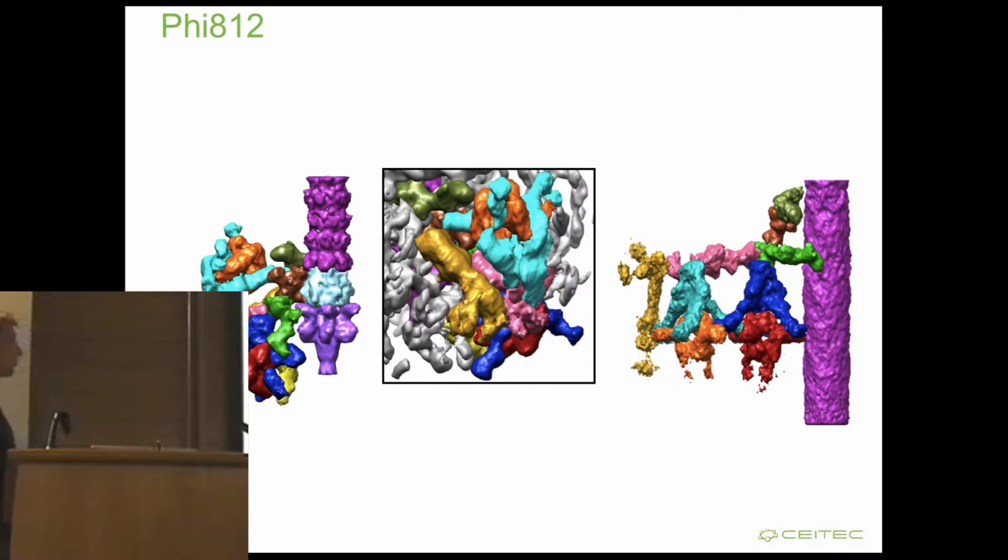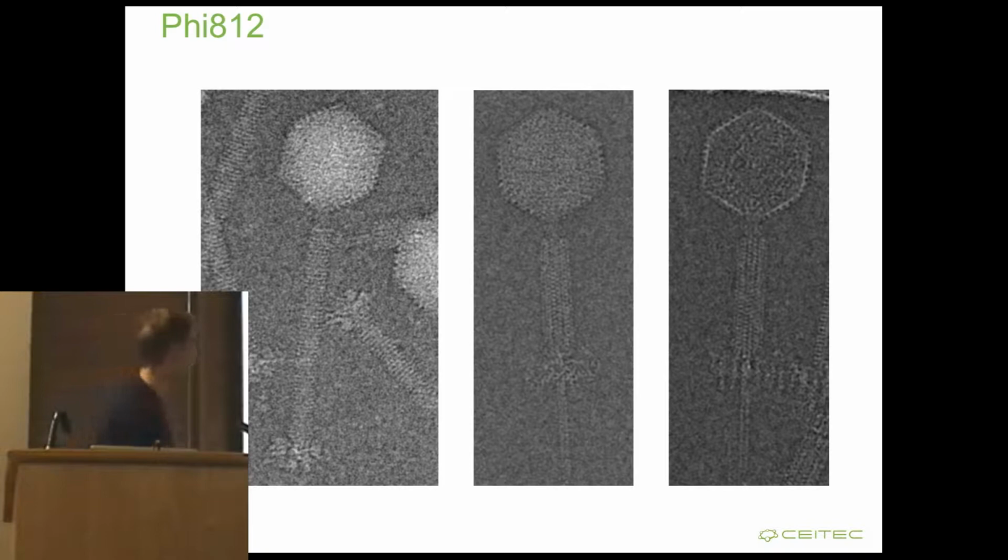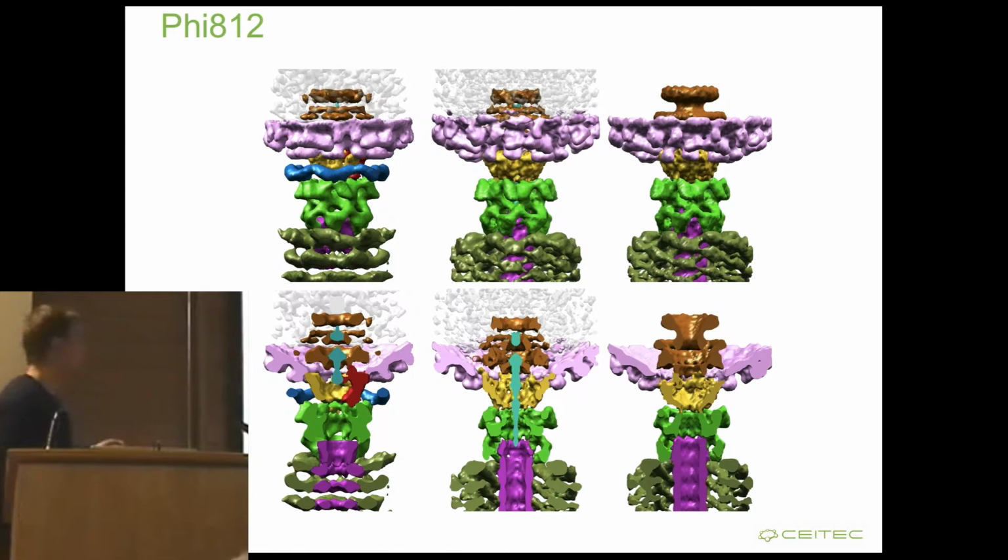When we were analyzing the data, we saw that, apart from the native phages and the phages with the contracted tails and empty heads, meaning that the DNA has been released from the head, we also see phage particles where the tail is contracted, but there is still DNA in the head. And we then took these three species and determined the structures of the connector regions, and found out that for this state where the tail is contracted, but there is still DNA in the connector, there is a conformational change in this portal, and also at the beginning of the tail tube, which probably prevents the DNA from protruding through the tail tube and outside the phage.